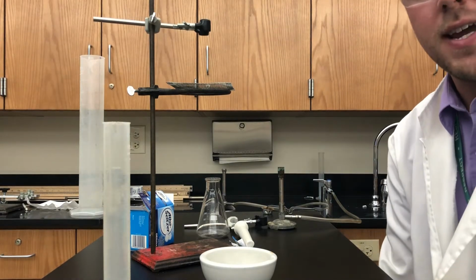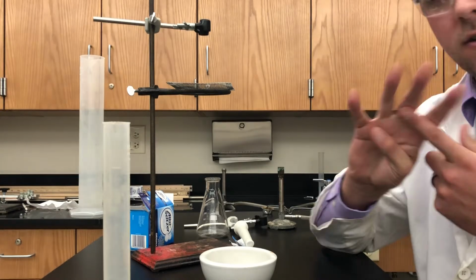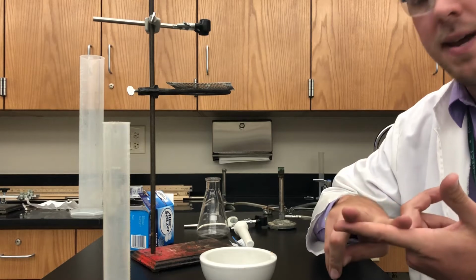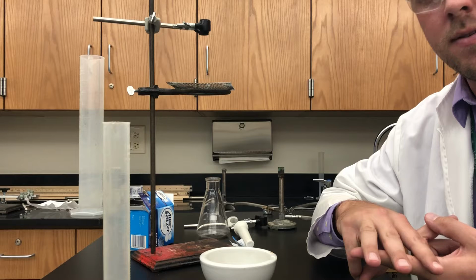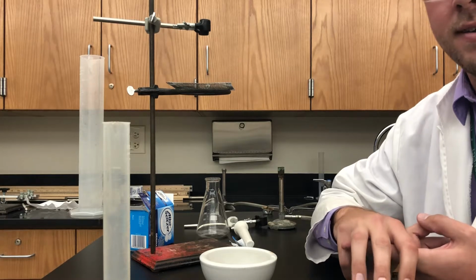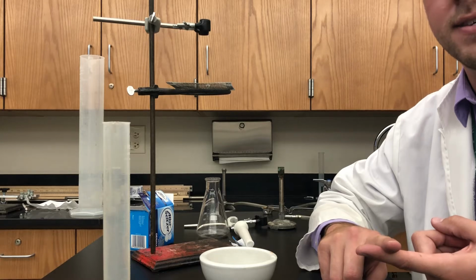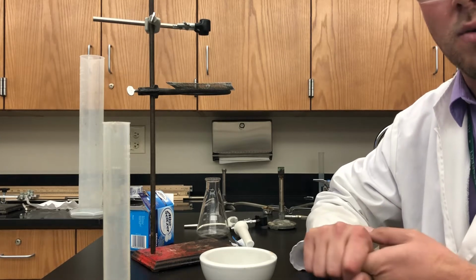Today we are talking about the reaction rates lab, and normally in these lab videos I like to cover four things. Number one, safety. Number two, the procedure and things to be careful about. Number three, any concepts we were learning about. In this case that would be how reaction rates are affected by temperature and by particle size. And number four, what control variables I want you to watch out for.